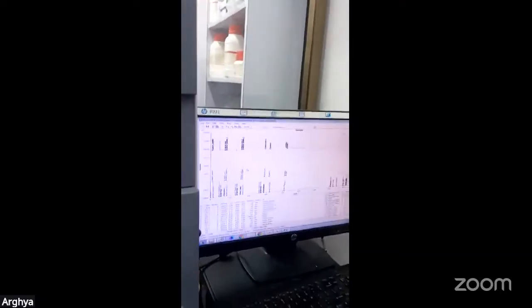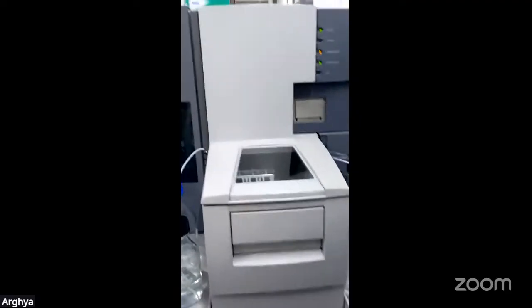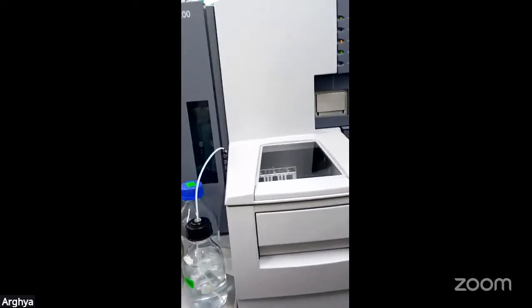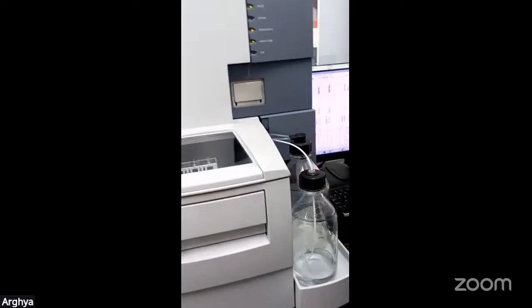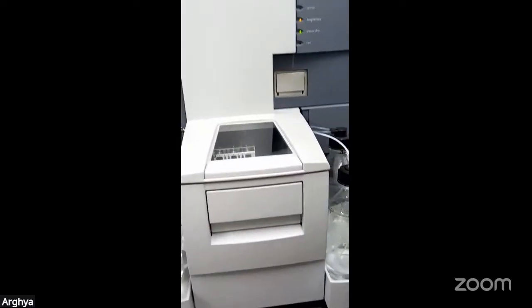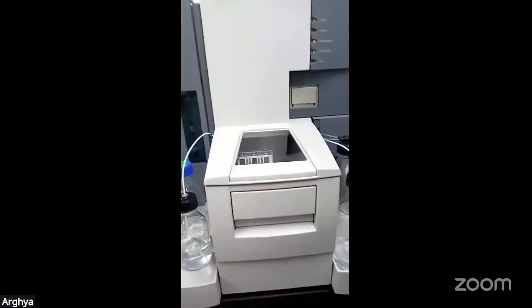So this is one of the powerful and robust tools. This is the Biacore T200 SPR, surface plasmon resonance, which can be used for the detection of KD and kon, and where the interactors bind. You have seen the gold-plated chip where the interaction happens, and we have also explained the principle of how SPR works. Back to you, Prof.